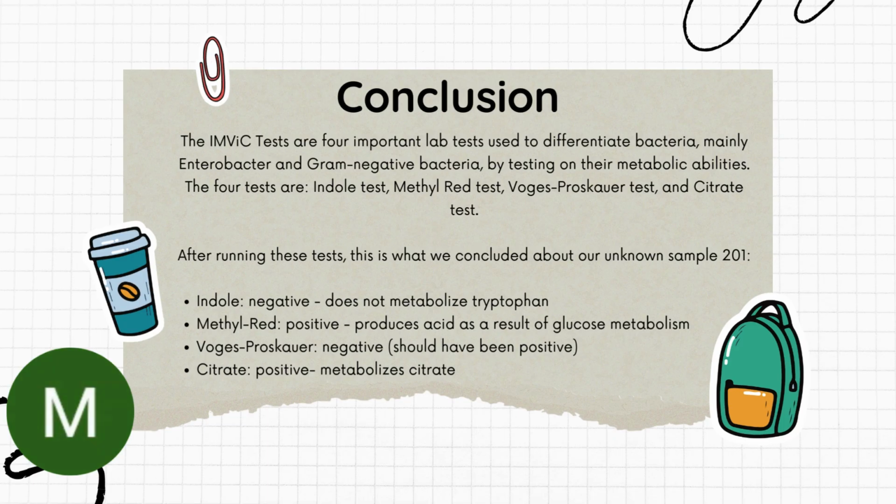In conclusion, the IMViC tests are four important lab tests used to differentiate bacteria, mainly Enterobacter and gram-negative bacteria, by testing on their metabolic abilities. The four tests are indole test, methyl red, Voges Proskauer, and citrate test.